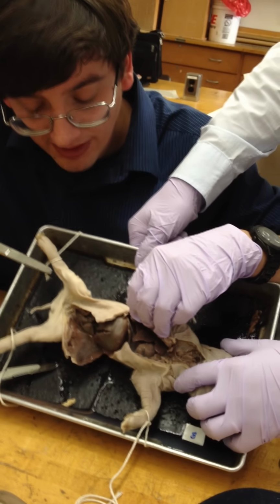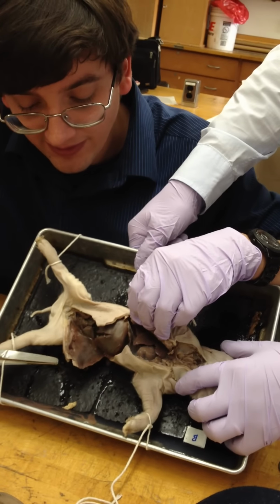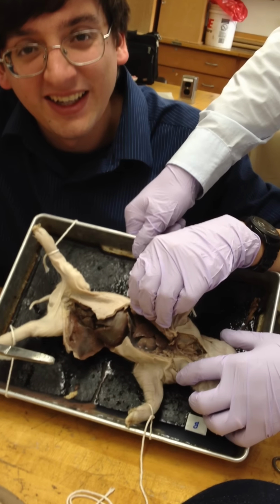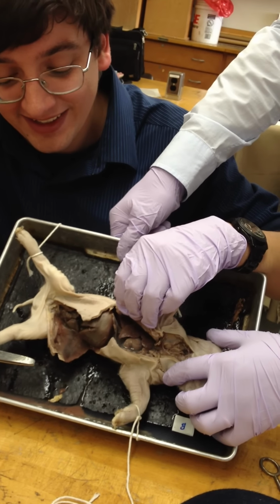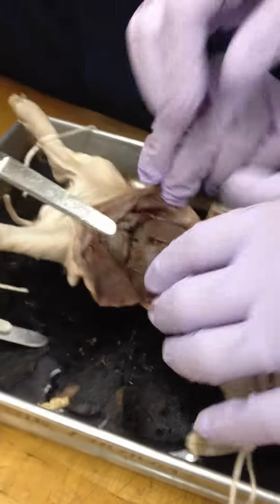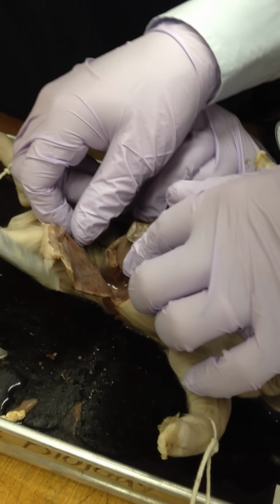That's gross. Ugh. Yeah, I know. I'm having an off day. That's all proteins. I'm trying not to watch. Oh, this smells worse than a cadaver, I swear. It really does. Formalin, which is formaldehyde.